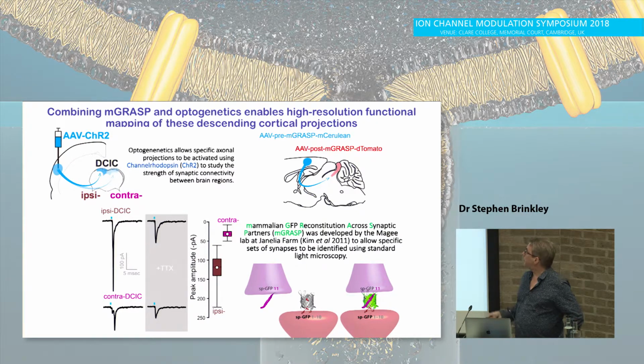Now, with these types of experiments, you get these highly polysynaptic responses, which you want to block. So you go into TTX. You also add 4AP in there to depolarize the presynaptic terminals a little bit, I assume, but I'm not really sure why. We've tried it with and without, and it seems to help if you have 4AP there. And then you get nice monosynaptic inputs. And the monosynaptic inputs also show larger responses in the ipsi than the contra, and that's the quantification there.